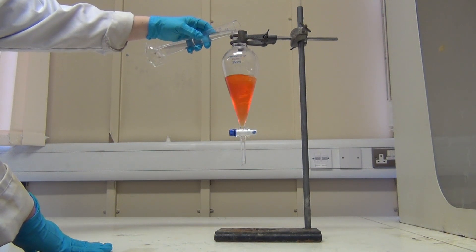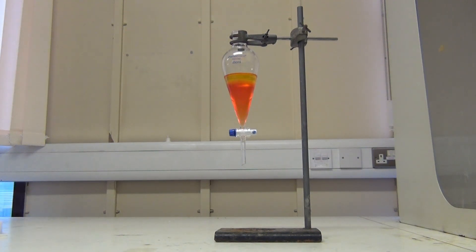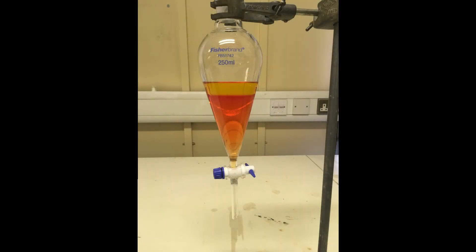One layer is the aqueous phase, and the other layer is the organic phase. Here we added colour to the aqueous and organic layers to show the separation more clearly, but it is more common for both layers to be colourless.